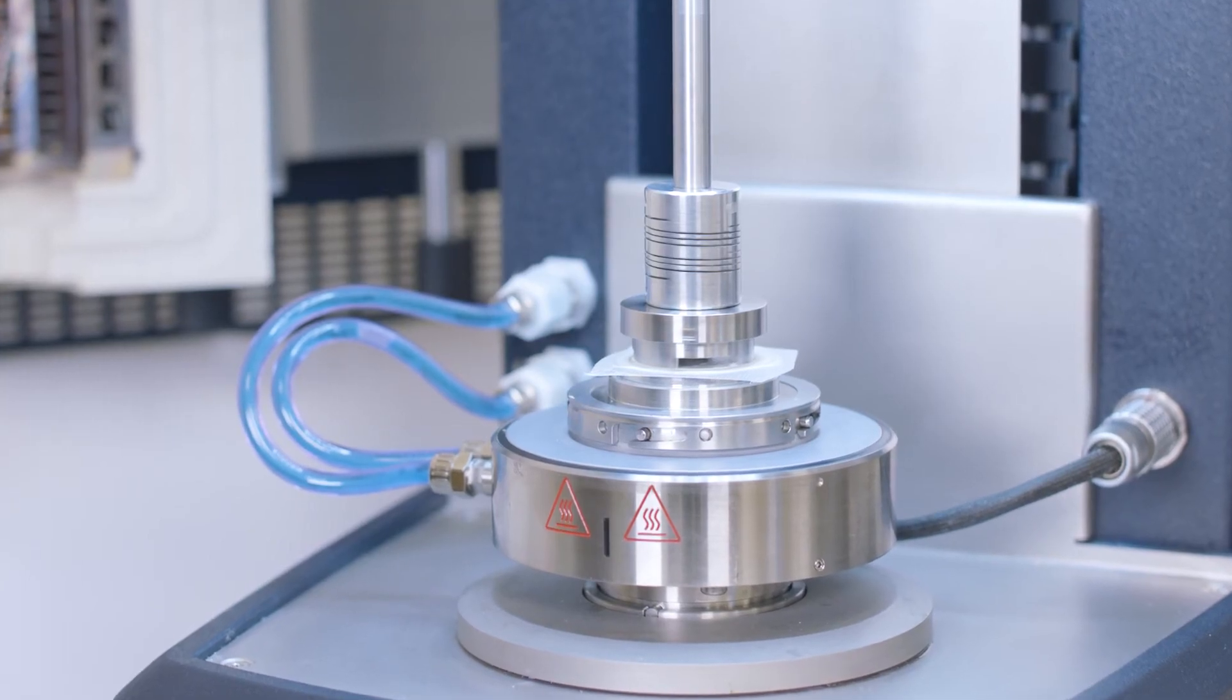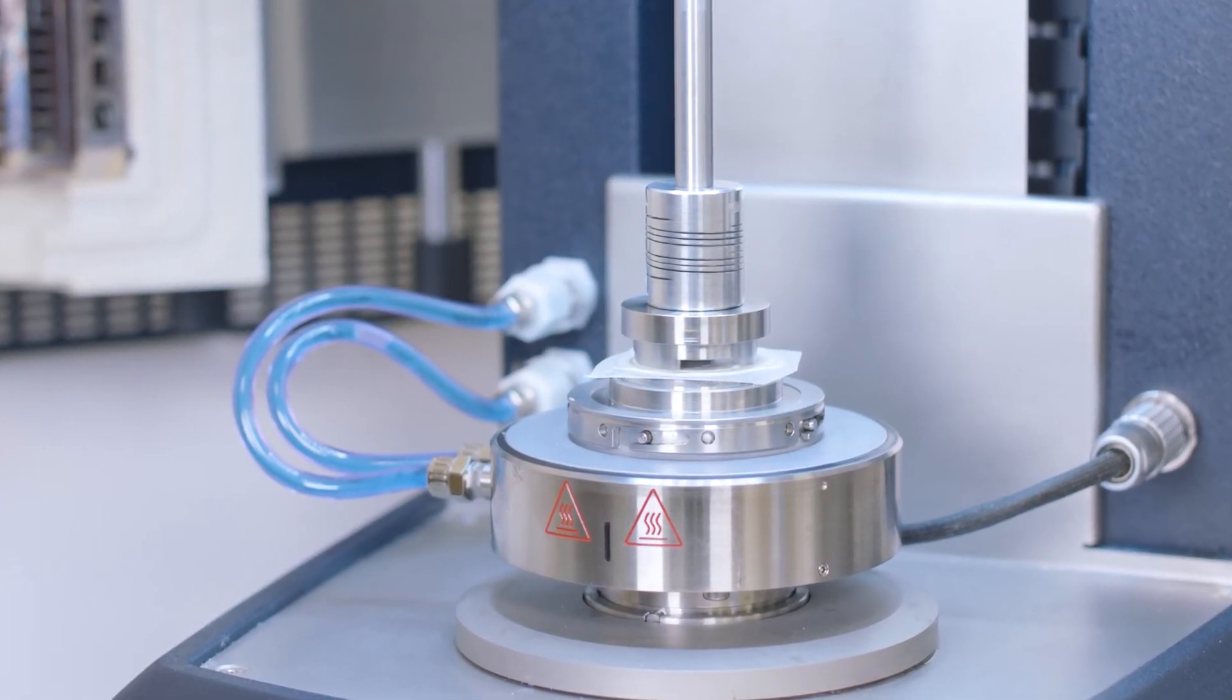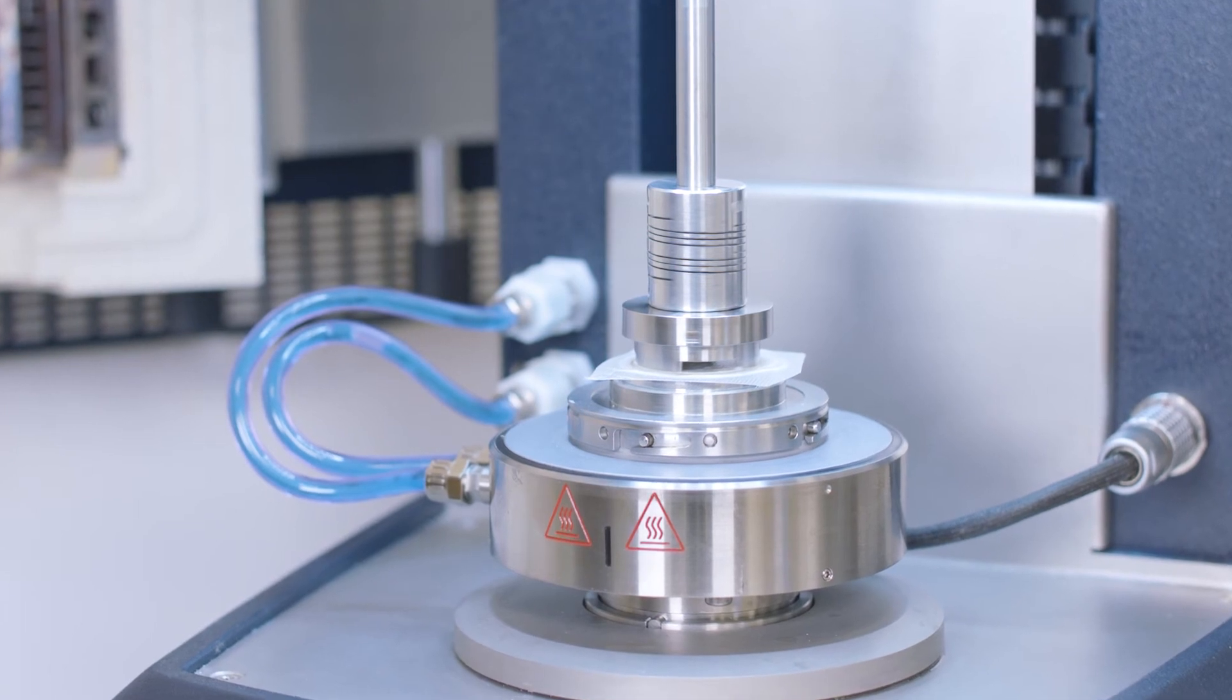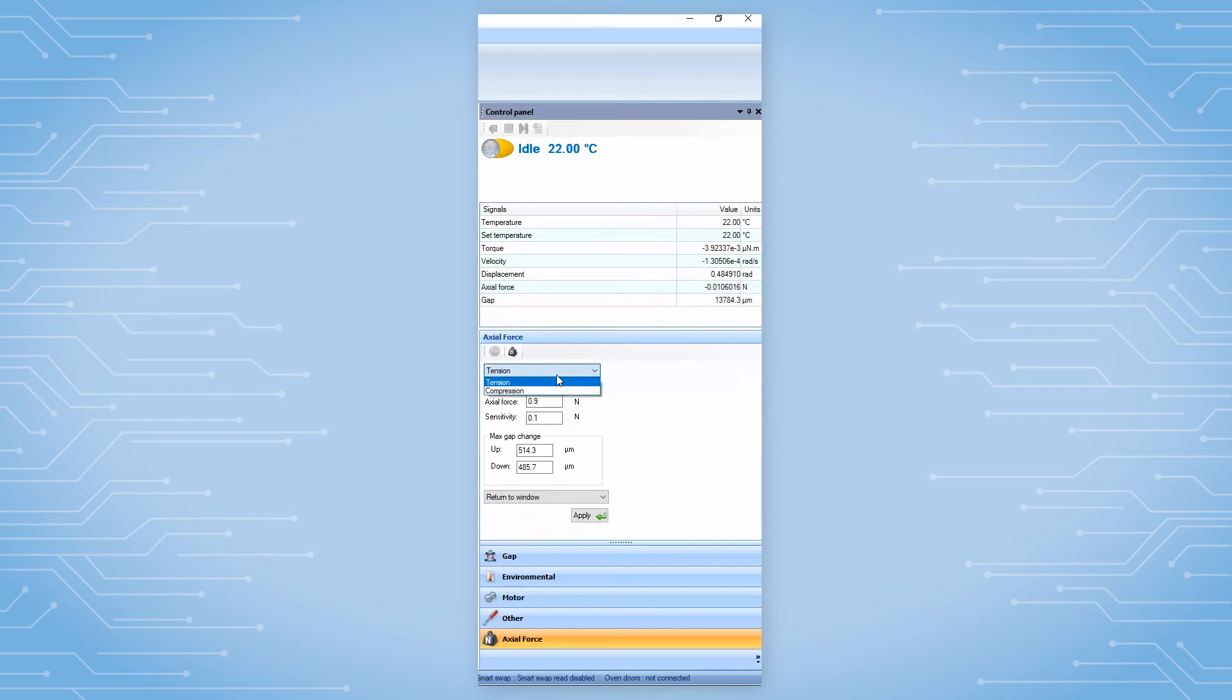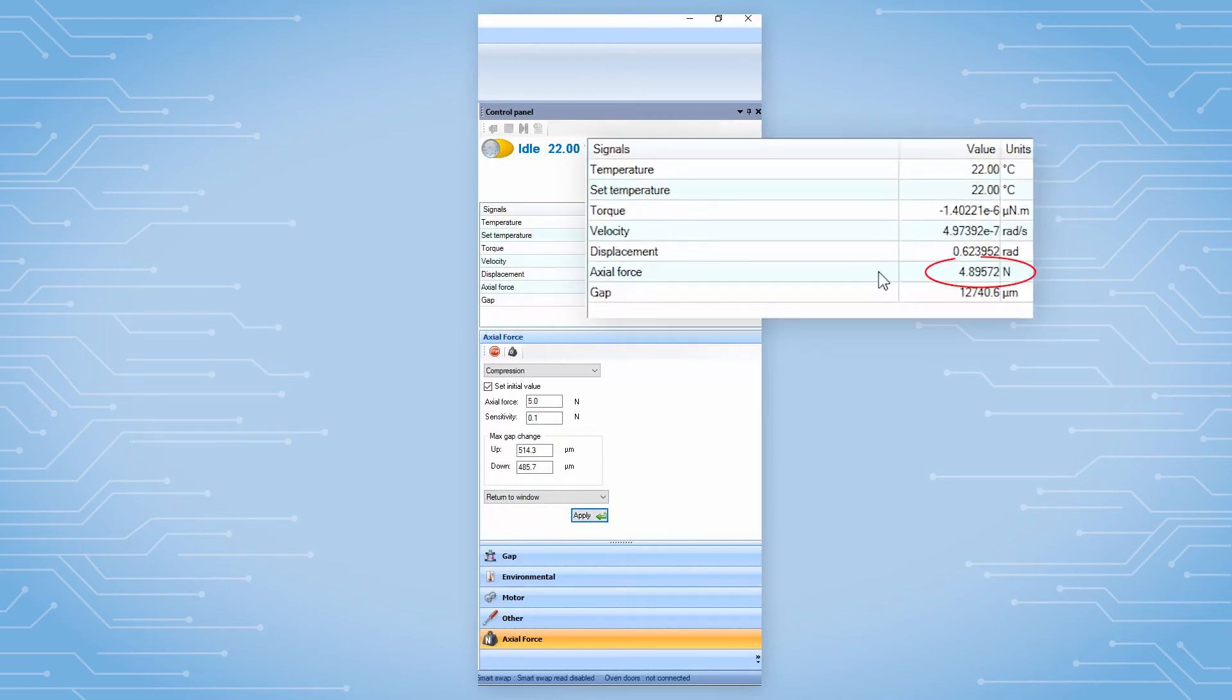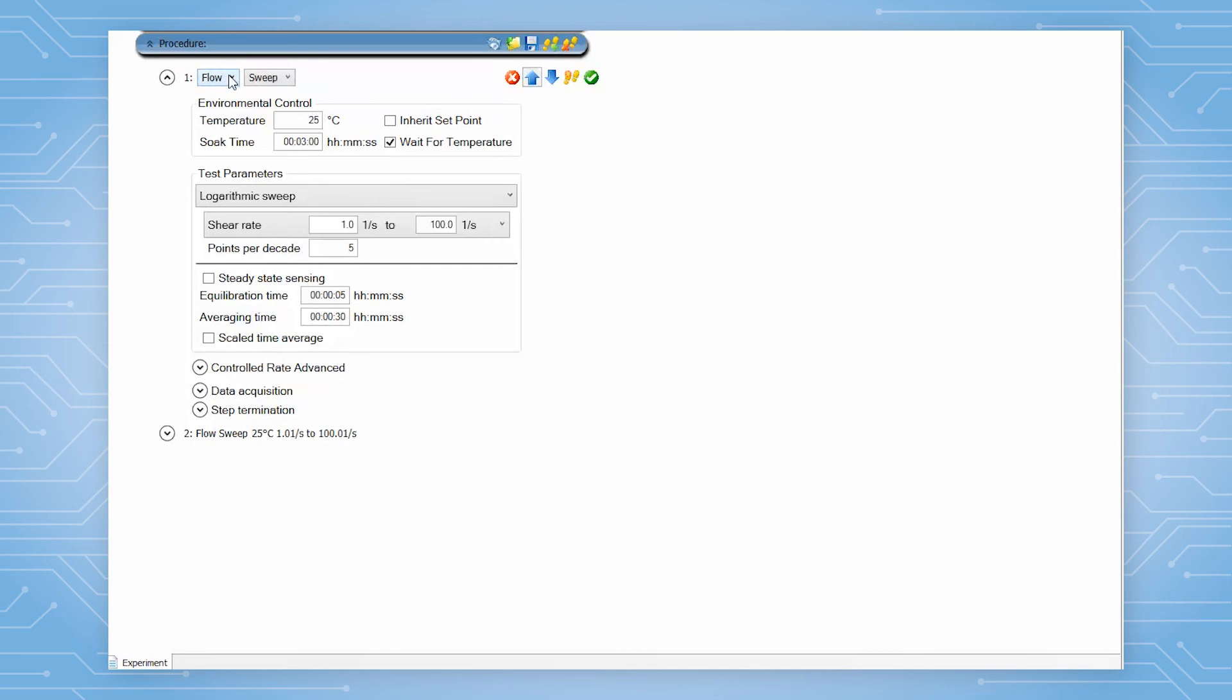After that, load your testing media. Lower the upper geometry until it is in contact with the bottom plate. Apply a constant axial force either from the TRIO's control panel or from the test procedure under the conditioning step.